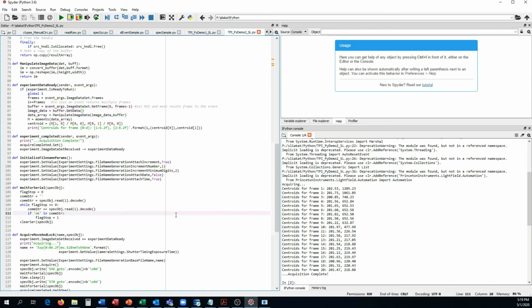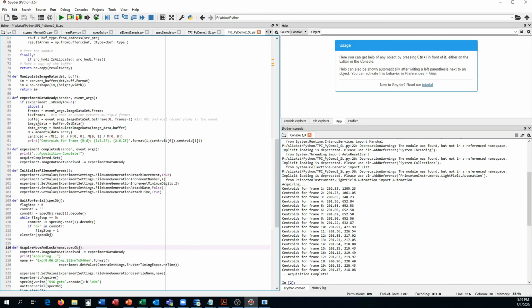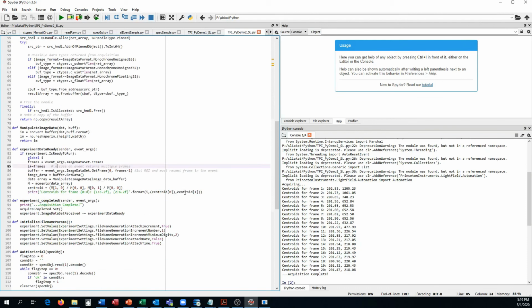I love MATLAB. It has lots of math functions, analysis functions, statistics functions. It's wonderful, but this is just the limitation for the live data grabbing. I found that if I do this exact thing that I did in Python with MATLAB, it wouldn't work. This object would just be disposed, and that's unfortunate. Which brings me to Python, which is, as I mentioned, my favorite way to do this type of development.